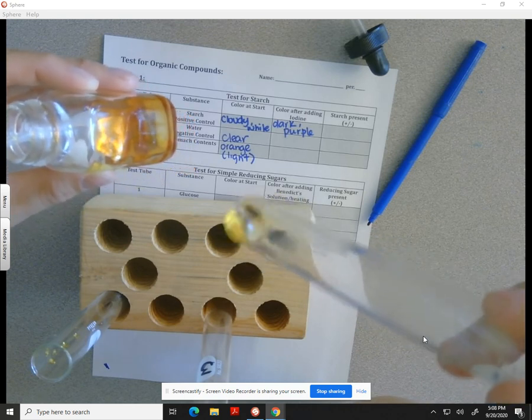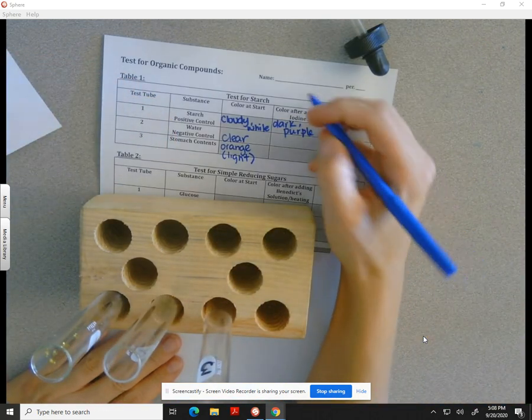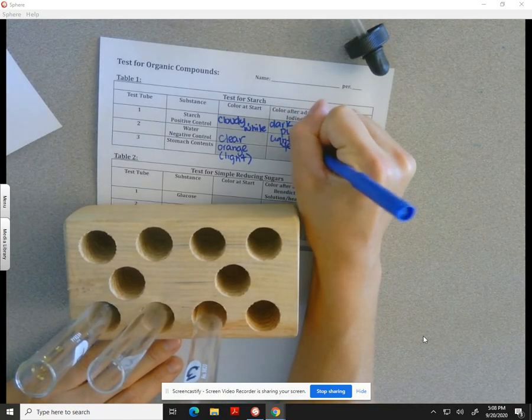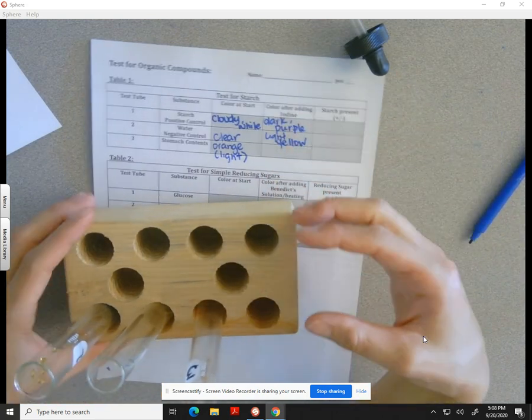I would say that's a good result, the result we were expecting, a negative result. And so what I'll put for my data here, color after adding iodine, I would just say light yellow. And again, that light yellow doesn't indicate a chemical reaction. It just tells us that we have created a mixture here between the water and the iodine.